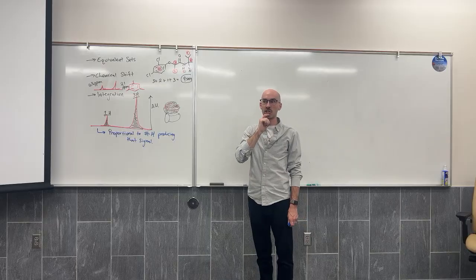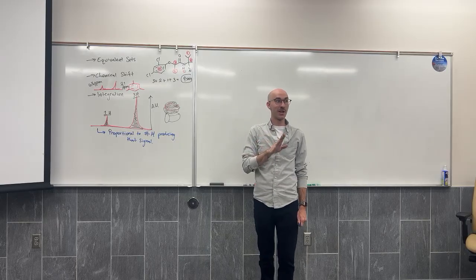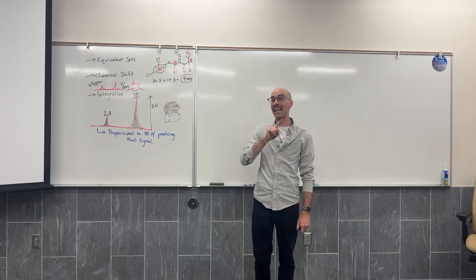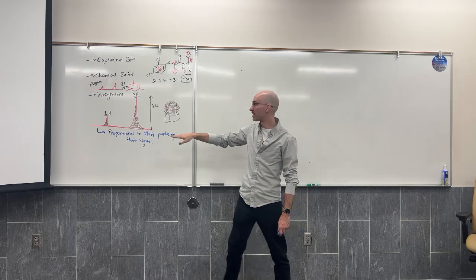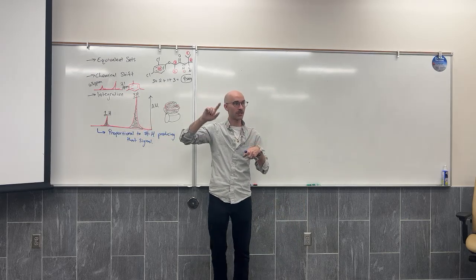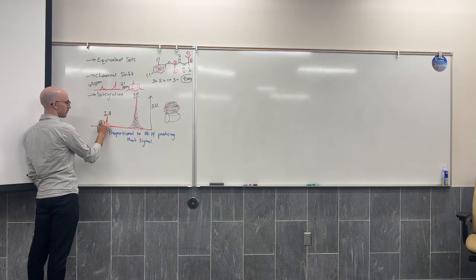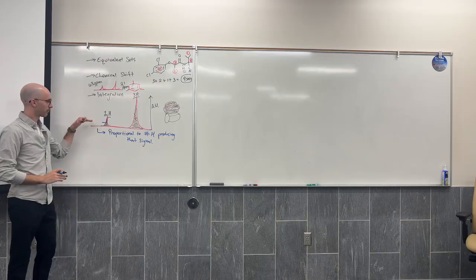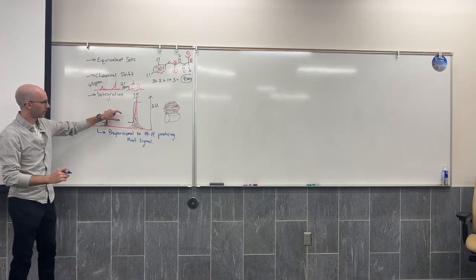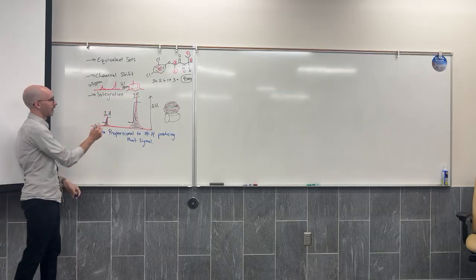Okay, now I'm going to show you the old way of integrating, where the computers wouldn't actually even give you a number. The computers would give you an integral line. They would take the integration of this, and they would say, here's the rate of change that we see. So instead, it would give you something that looks like this. 1 to 3. That's an integral line.